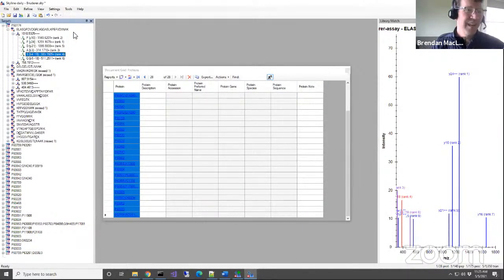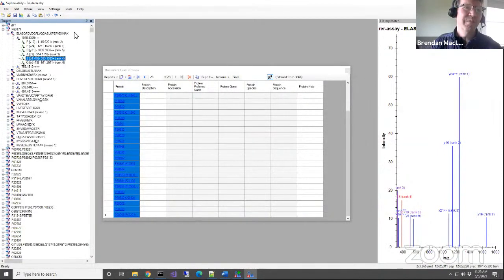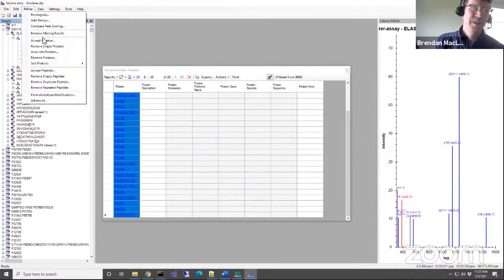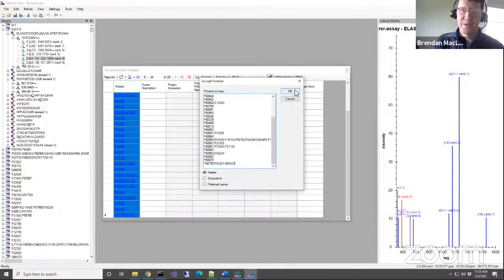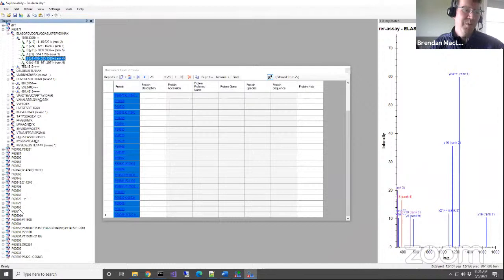And wow, it did take out the IRT. So usually we try to avoid that. So you would have to also add IRT as one of your protein names. So luckily we can undo everything, and we would go IRT and then everything, and click OK. And now we didn't get rid of our IRT, but we narrowed our list down quite a lot. And so I'm going to undo that again.